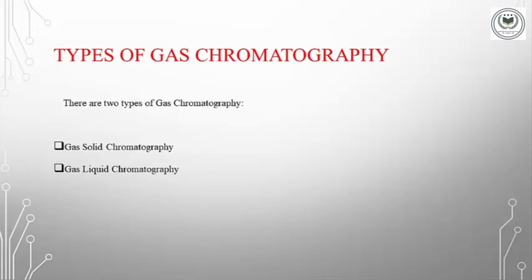Significance of gas chromatography. Useful in food quality analysis, useful in detection of blood alcohol, helpful in determining drug or alcohol consumption in the deceased. Gas chromatography plays a crucial role in detection of samples in fire and arson cases.